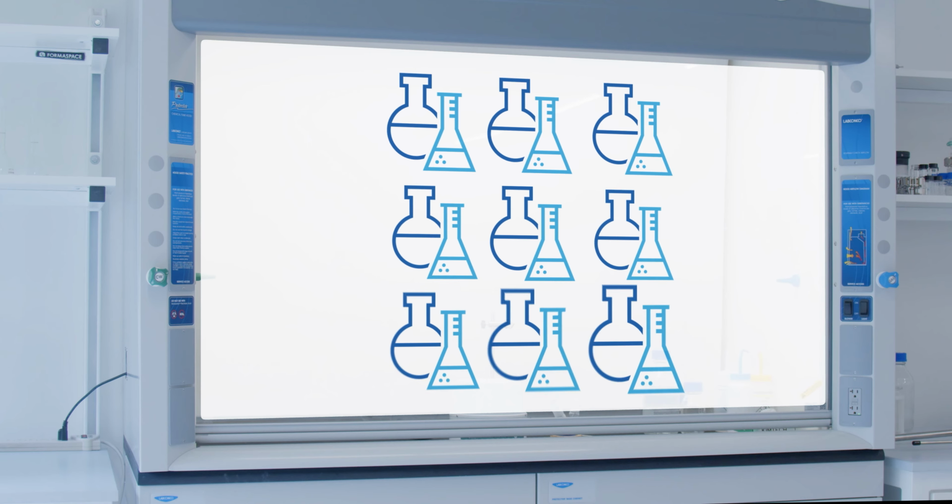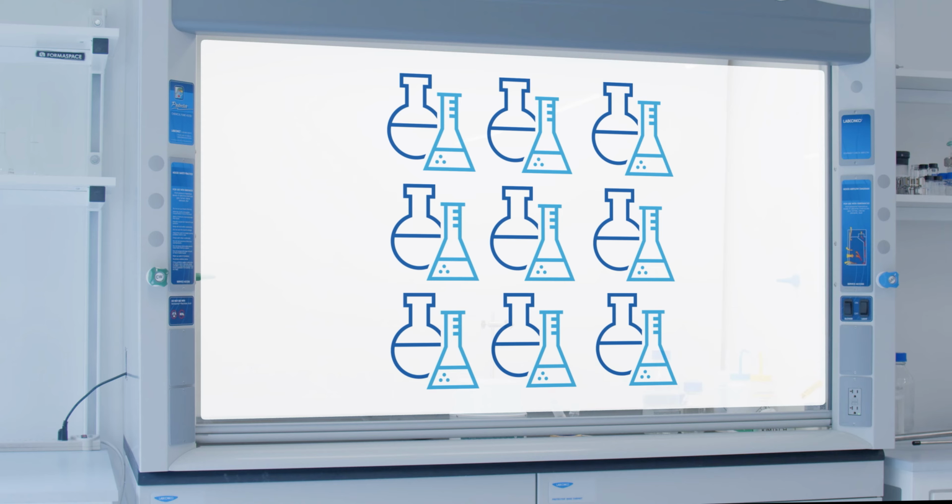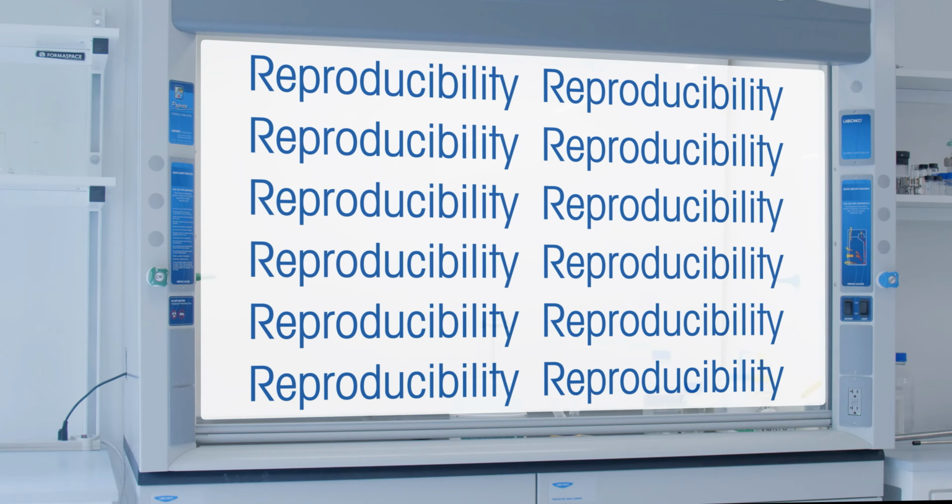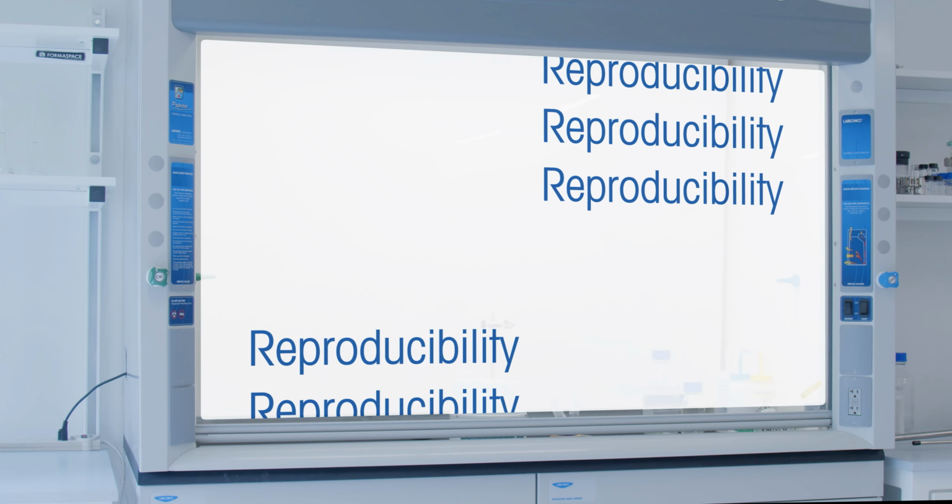Chemical experiment reproducibility is known to be one of the biggest challenges in academic research labs. Obviously, replicability is one of our first and foremost reasons of why we use EasyMax. We can increase yield, and the replicability is fantastic, and we can actually have a lot of control on the processing parameters, right? Reproducibility is not easy to achieve with manual setups due to a couple of factors.